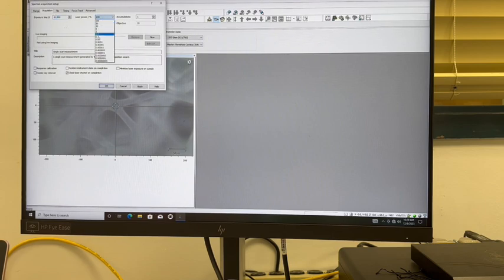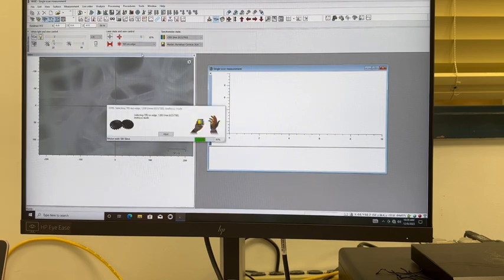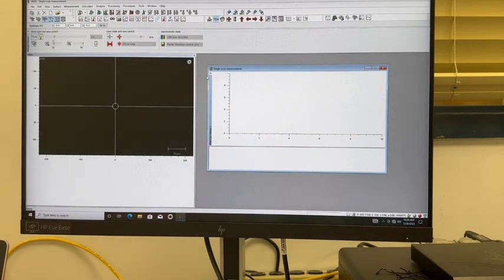The exposure time is auto set to 10 seconds. However, the laser power needs to be selected. I will start by selecting 1% laser power and 1 accumulation. The laser power is the percentage of laser that will be shown onto the sample. The number of accumulations are how many readings will be taken for that sample. Typically, 1 accumulation is adequate for most samples.